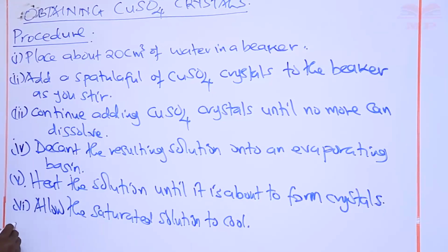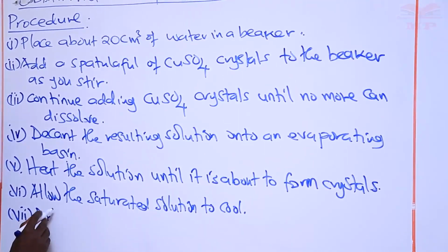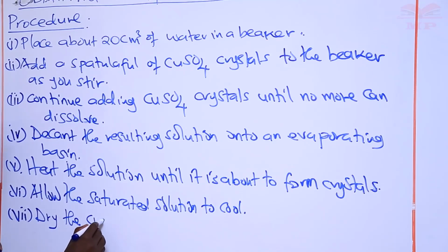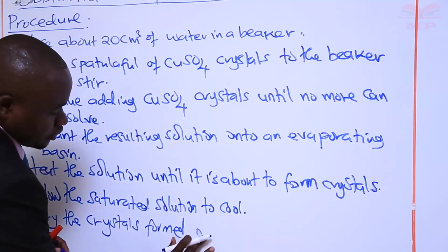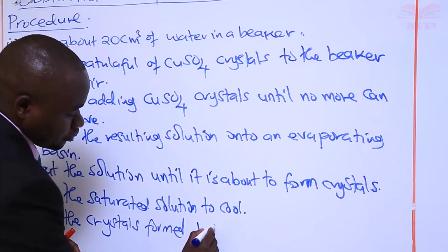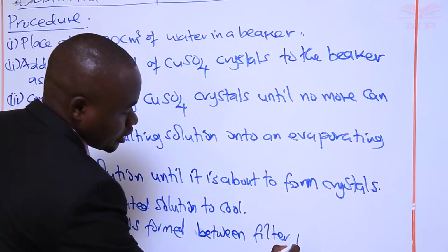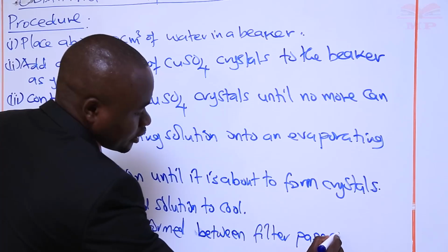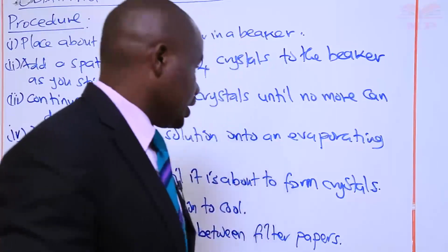And then, lastly, you dry the crystals formed using or between filter papers. So we shall see why we are using filter papers to dry the crystals formed.